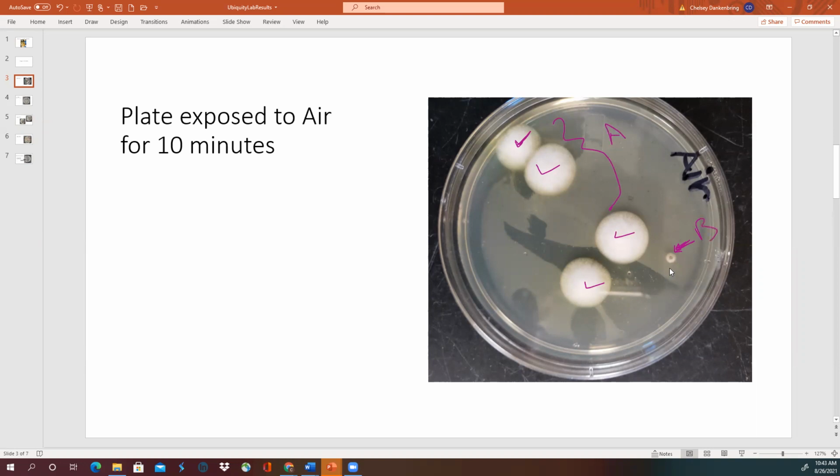But this would be a different species, because as you're going to see later in the class, different organisms grow differently on an agar plate. For instance, this goes on your handout. Staphylococcus aureus is an organism that is commonly found on our hands, and it grows as a gold color on an agar plate. And you're going to see it here in just a second. But Staphylococcus aureus is one of the only organisms that grows as a gold color on an agar plate. So that one, you can look at it and go, oh, that's gold. I know what that is. Okay. But things like fungus, at least personally, I don't know the different types of fungal species based on their growth. I'm more of a bacteria person.